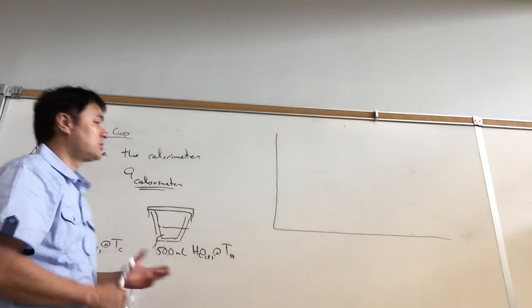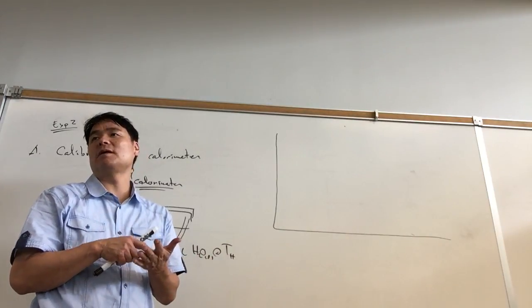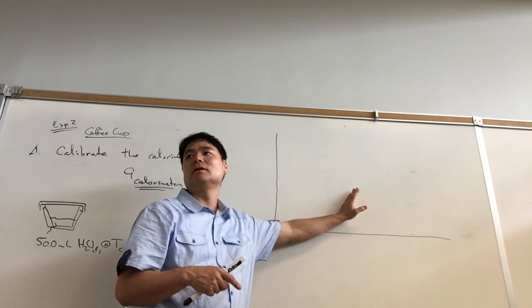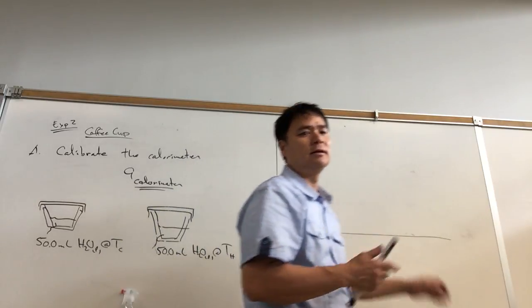The data acquisition system that we're going to use is called LabQuest, and it's pretty easy to set up. All the LabQuest system allows you to do is monitor the temperature at regular time intervals. So we're going to be taking the temperatures every 1 minute.